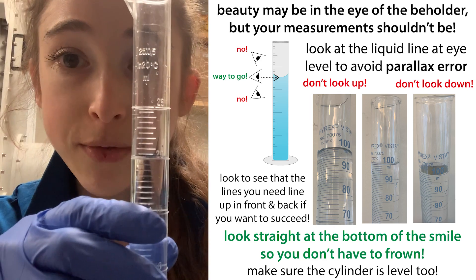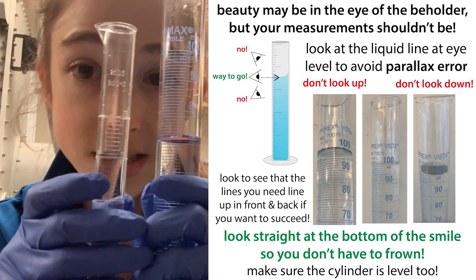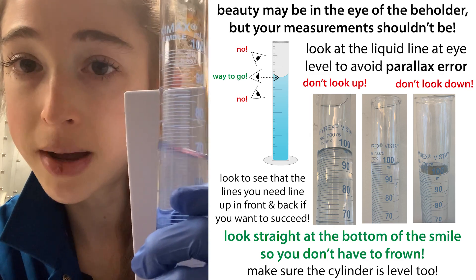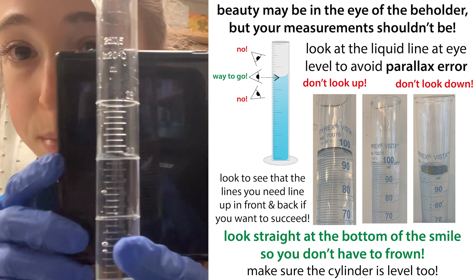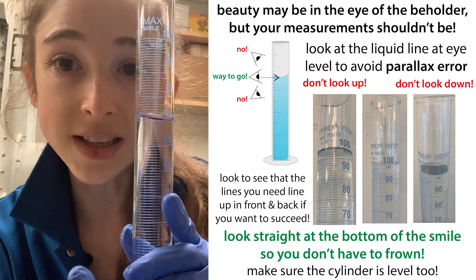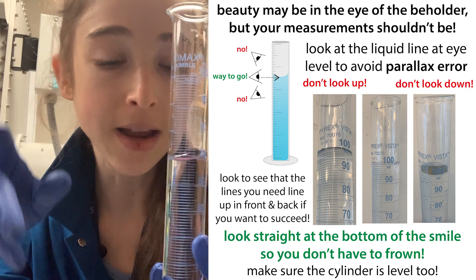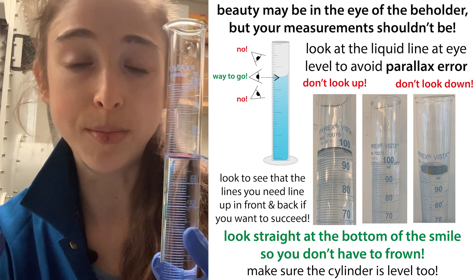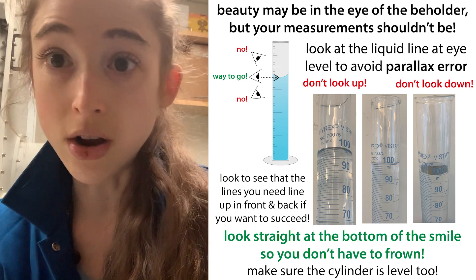This works the same for whatever measuring tool you're using. Sometimes there are dark lines and sometimes there are light lines, and it can be hard to tell where the liquid is and where the line is. If you're working with something with a dark line, stick something white behind it. If you're working with clear lines, sometimes putting something dark behind it can help. Just play around with whatever works for you. But remember to keep the thing level—look and see if the lines are lining up, make sure your eyes are level with it. This might mean you have to squat down or step on a stool, but it's really important that you are measuring the bottom of the meniscus on the line.